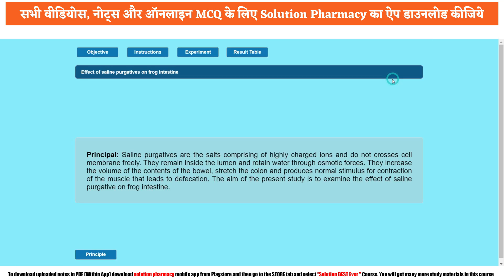The next tab is the experiment tab. Before going to the experiment, you can see the principle, which I have already explained. Saline purgative salts comprise highly charged ions and do not cross the cell membrane. That is why they allow liquid to come inside them — they remain inside the lumen and retain water through osmotic force. They increase the volume of contents of the bowel, stretch the colon, and produce normal stimulus for contraction of the muscle, leading to defecation.